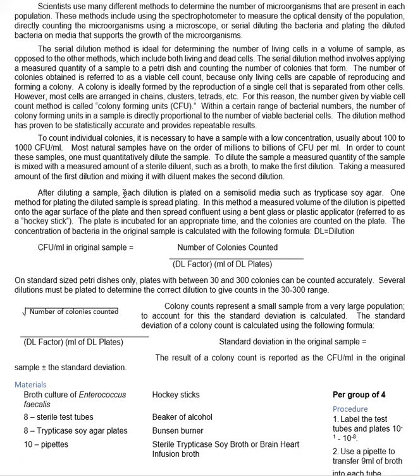And then after this, we're going to take each of those test tubes and put a measured amount on a TSA plate. Now what we're going to put is actually 1/10 of a milliliter. We have to use pipettes for all this, guys, in order to get accurate measurements of 1 milliliter and 1/10 of a milliliter.